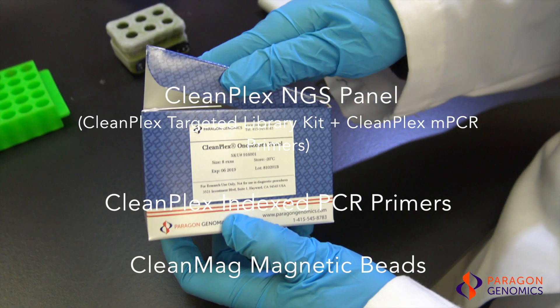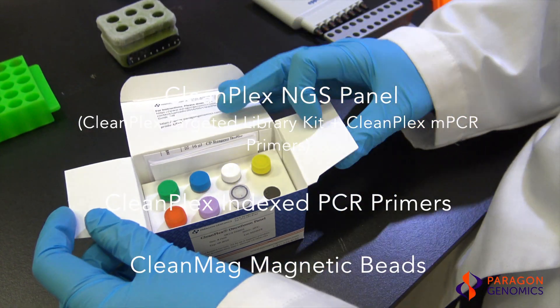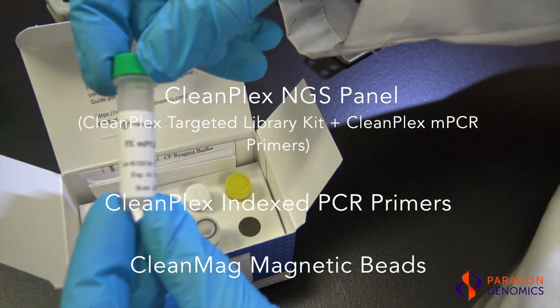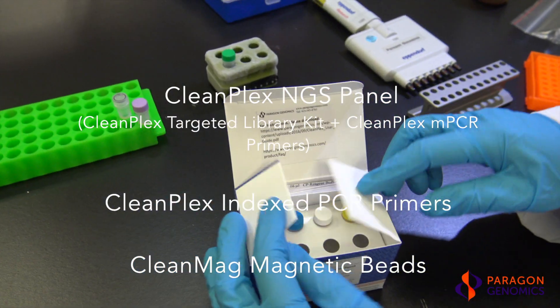Each CleanPlex panel contains a CleanPlex targeted library kit and panel-specific CleanPlex multiplex PCR primers. CleanPlex index PCR primers and CleanMag magnetic beads are purchased separately to complete the workflow from input DNA to sequencing-ready NGS libraries.